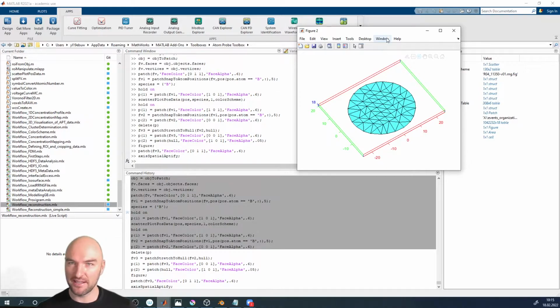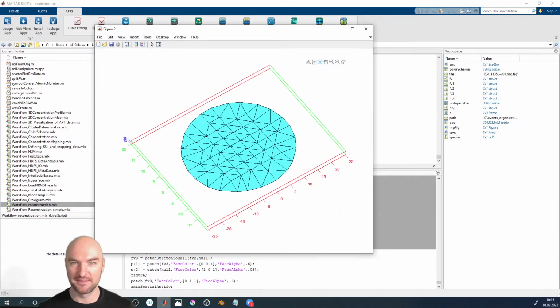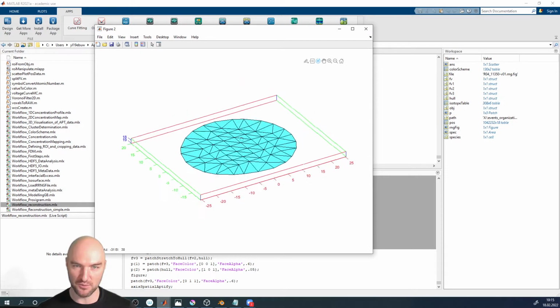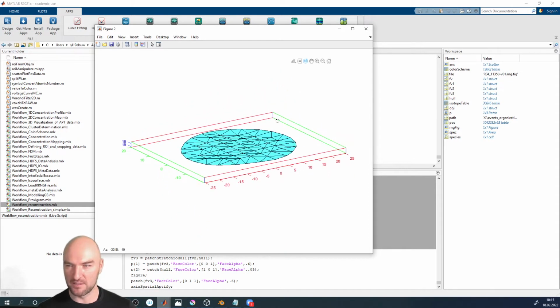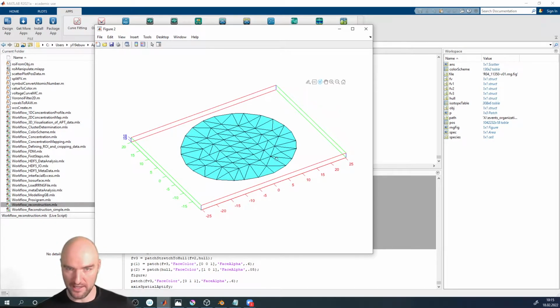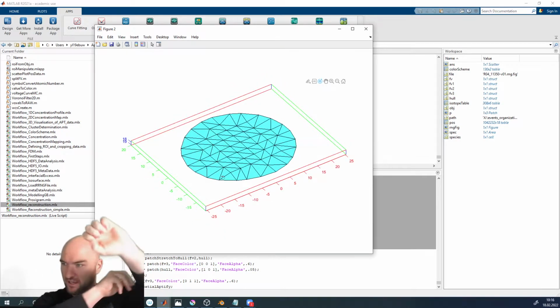So the only thing that's maybe still a little bit uncool is, well, we have some triangles that are like nice quads, and then we have some triangles that are sort of elongated. So we have this area that sort of still represents what we had earlier with our initial try. And then we had all of the vertices that have been stretched to the boundary, moved by me manually, and so on and so forth.